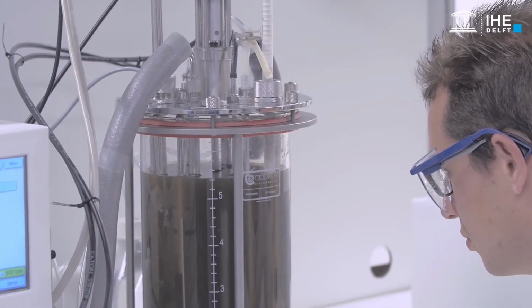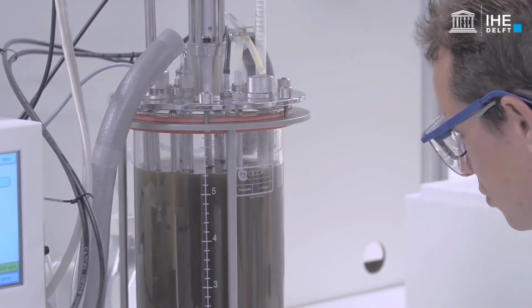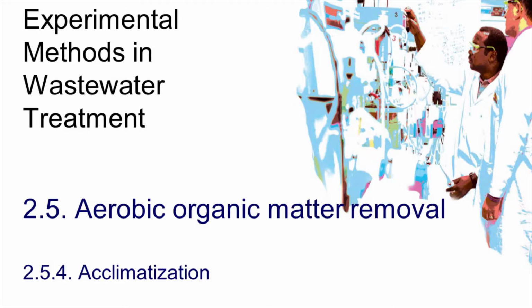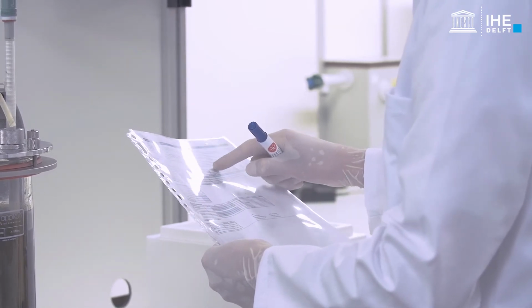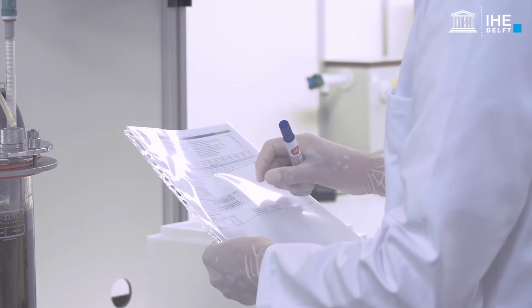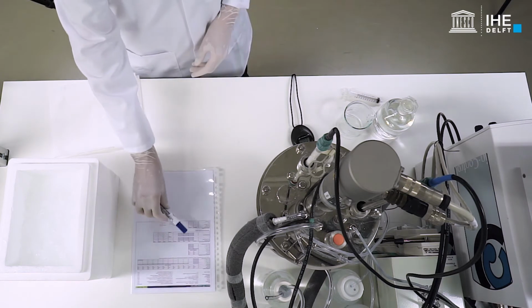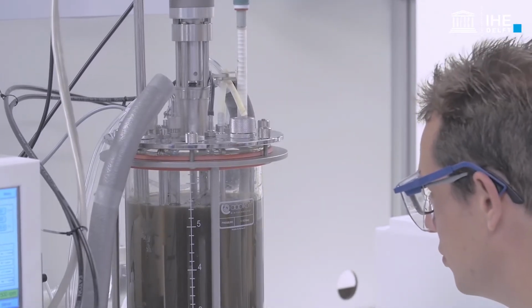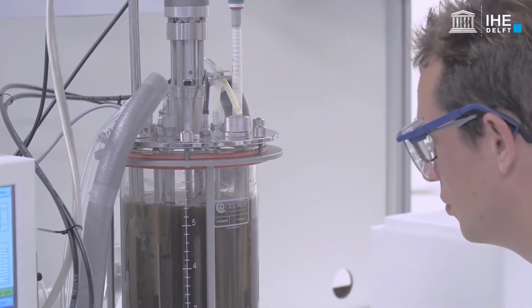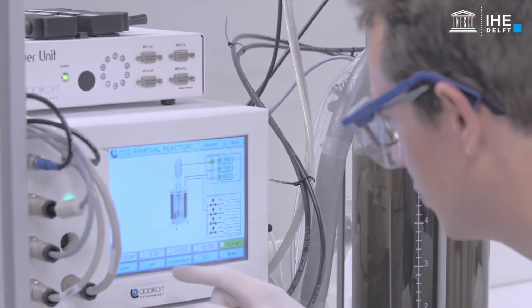Otherwise, increase the speed until the mixed liquor looks homogeneous. Confirm the steps to be followed and their sequence in the working sheet. Verify that the operating and environmental conditions are stable and within the expected ranges.